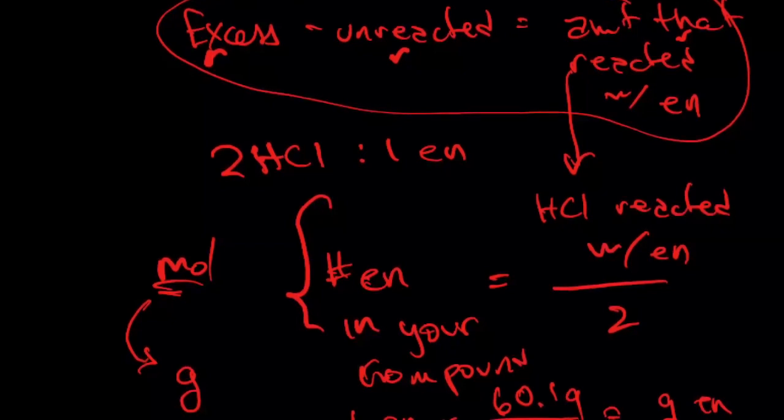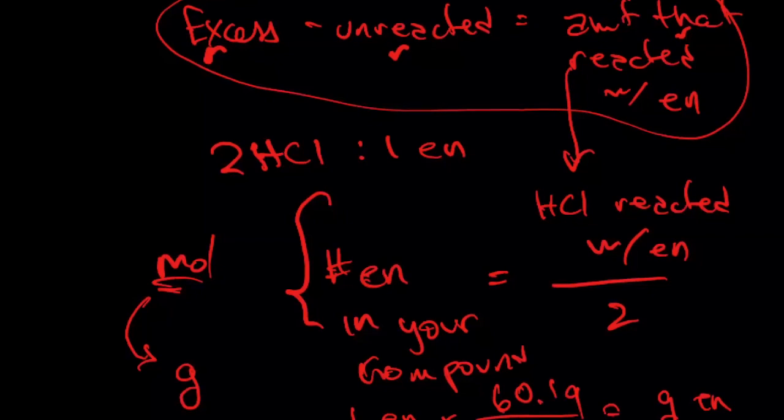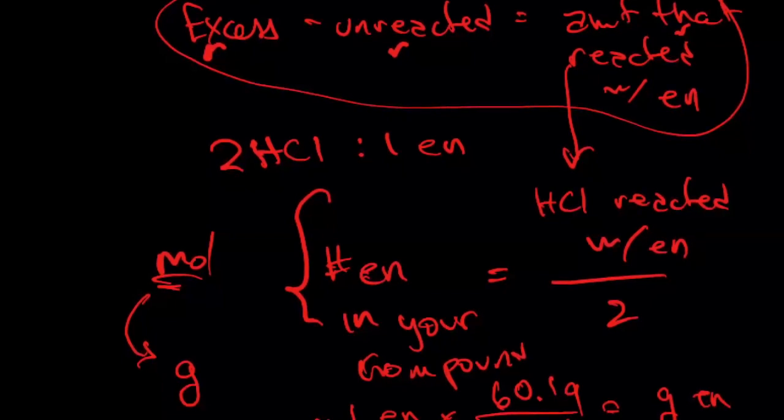Hopefully you guys are following me, okay? Let me go back. You weighed a certain amount of your salt, A, B, and C. These are 3 separate experiments. Then you take the mass of your salt, which you weighed at about 0.05 grams.